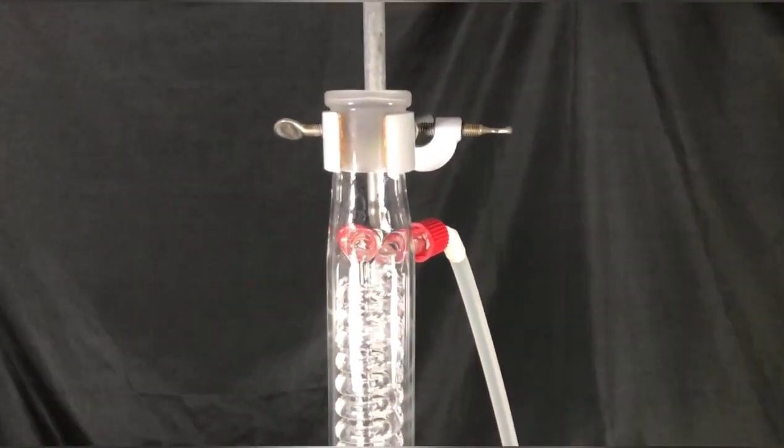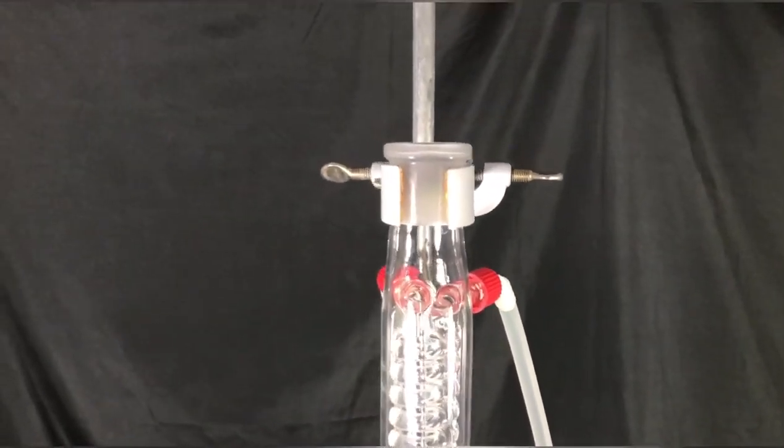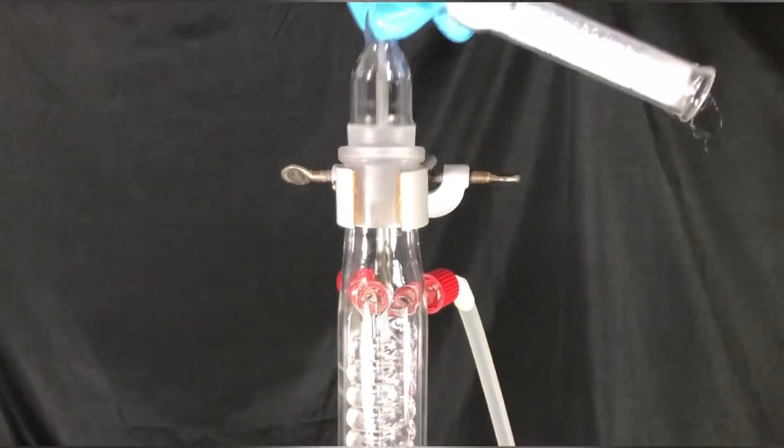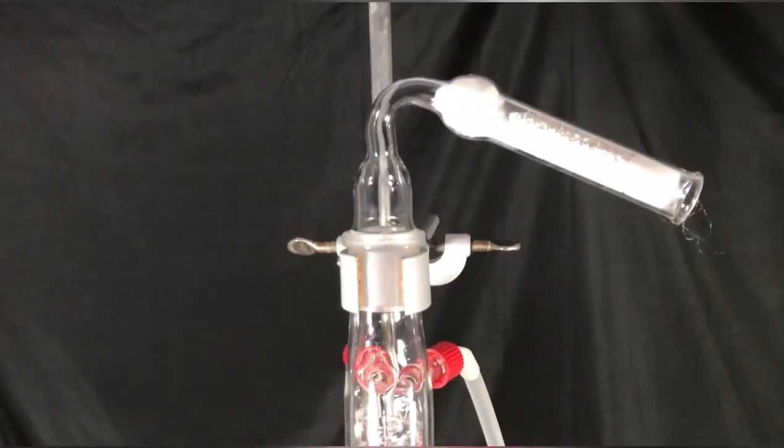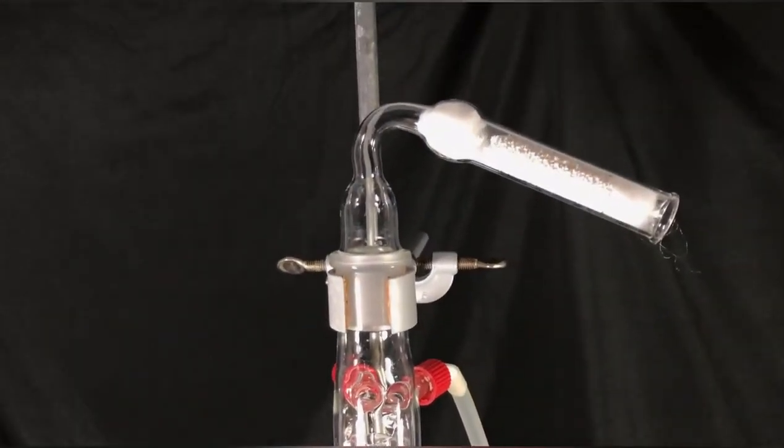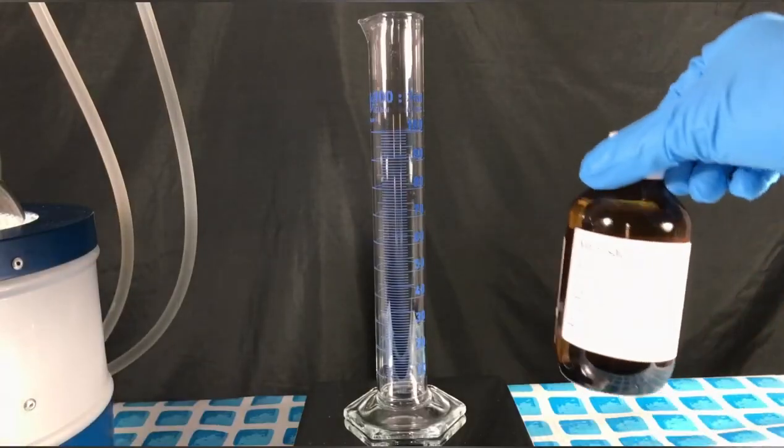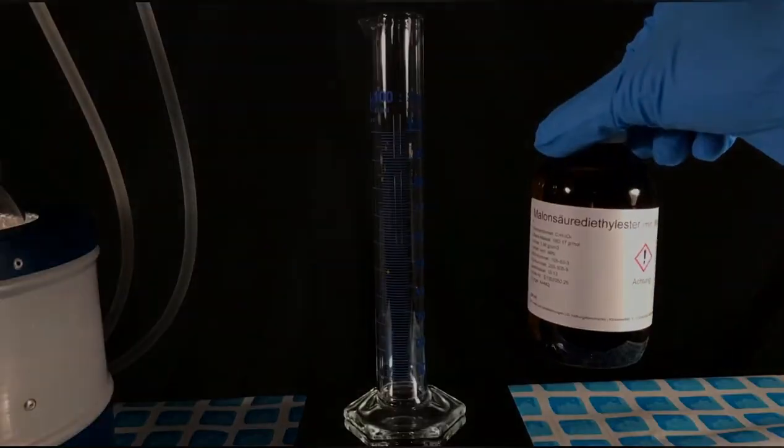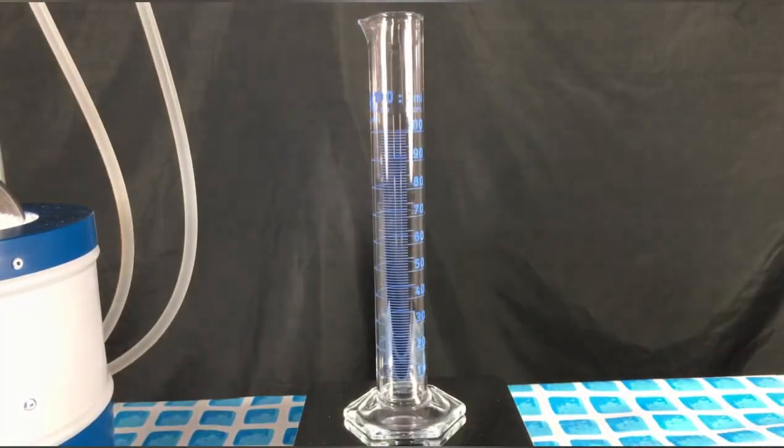It took approximately 10 minutes for all of the sodium to dissolve. When the sodium had dissolved, the gas outlet tube was switched out for a drying tube. The drying tube is filled with calcium chloride to prevent any water from entering the apparatus. Any water present will decrease the yield, therefore the ethanol also has to be as dry as possible.